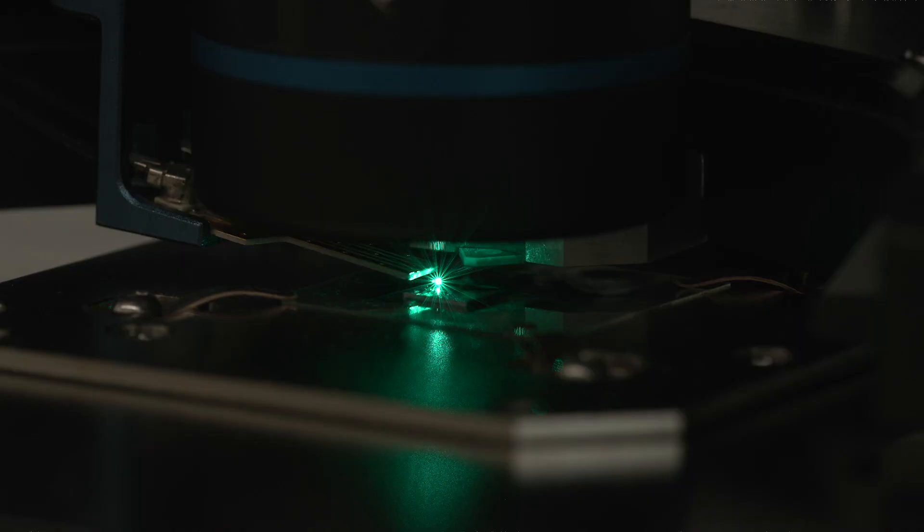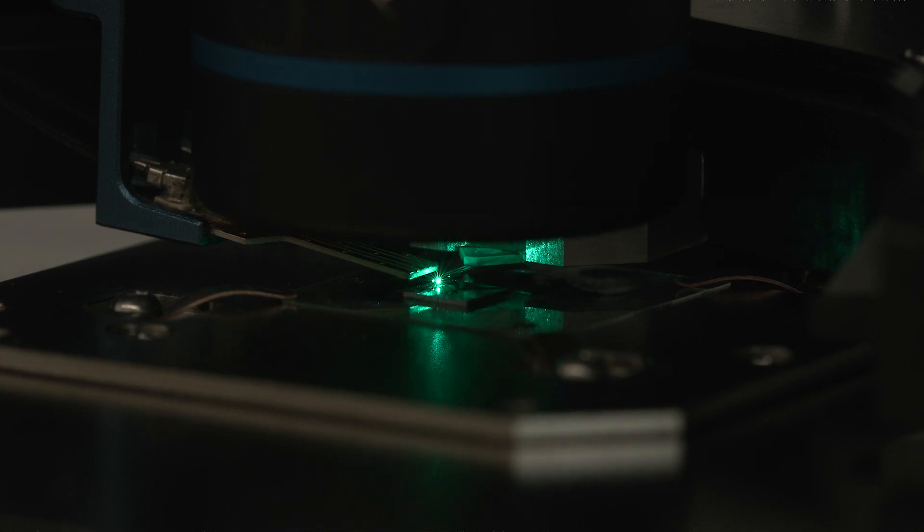The scanning tip is important to the measurement because it contains the NV center at the tip, and this is the sensor that we use to detect magnetic or electric fields. Furthermore, the nano-pillar structure in the diamond helps to improve collection efficiency so that we can collect more of the NV center fluorescence.